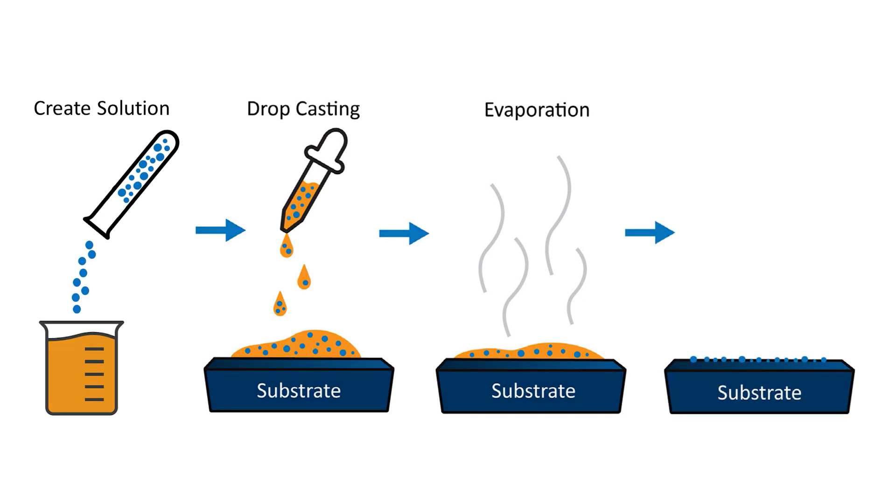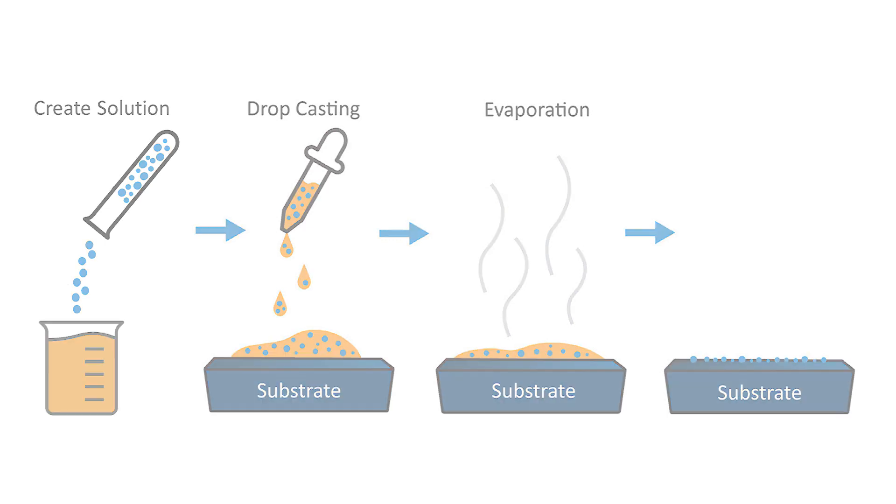Drop cast particles are held to the surface by van der Waals forces, so a flat, featureless surface is an ideal substrate. You can cast larger particles directly onto carbon tape stickers, but if the particles are too small, they can sink into the surface, making examination of their morphology difficult.